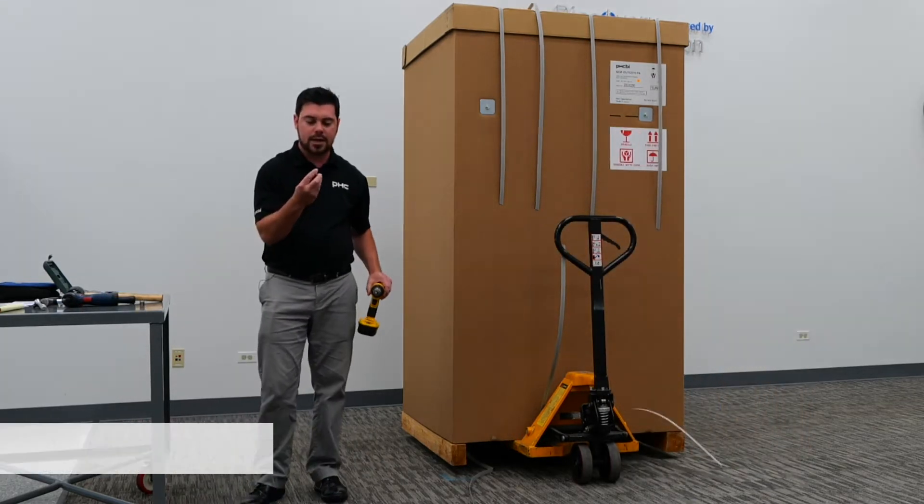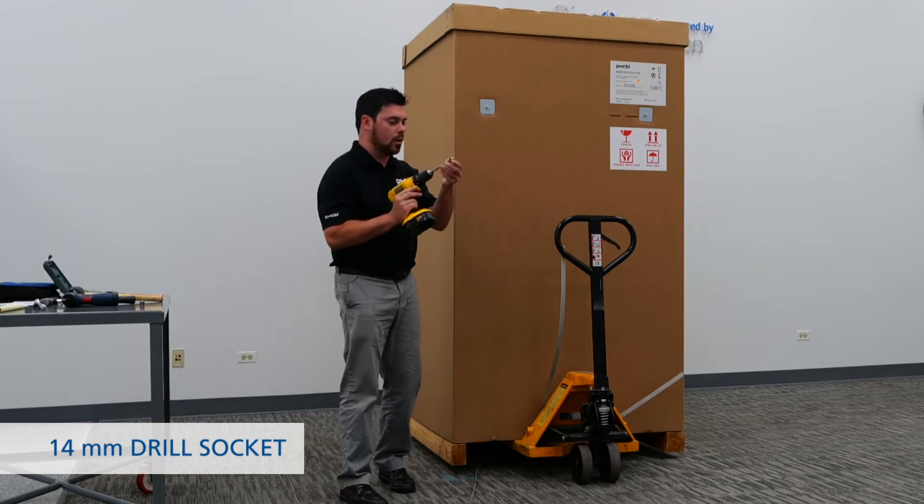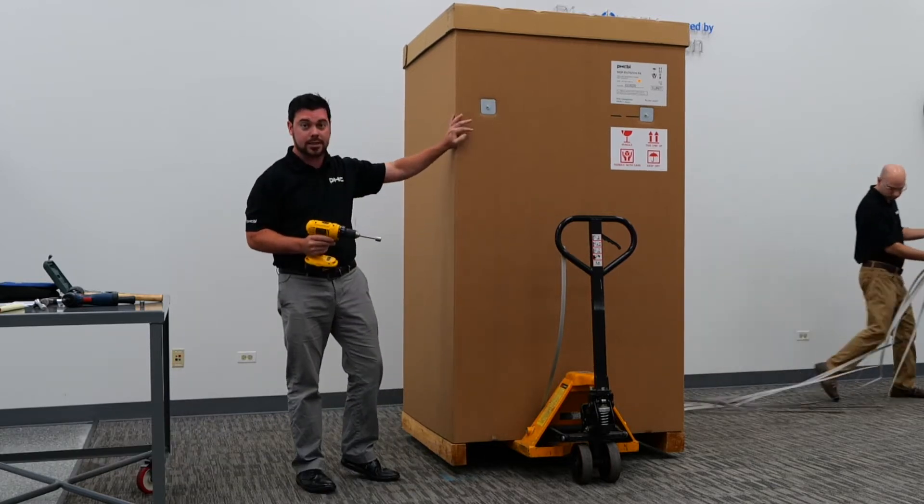Next, we'll go ahead and take our 14mm socket with our drill and remove the back plates securing the box to the unit.